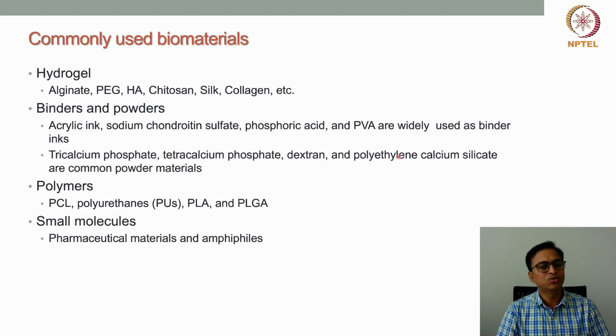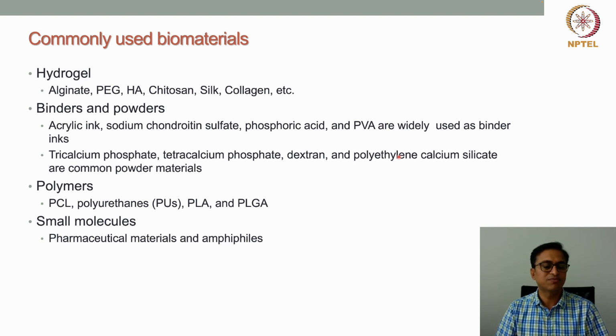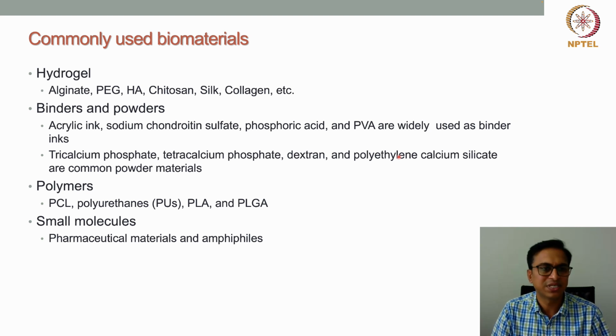But we need to consider the viscosity of these materials, because the viscosity should not be very high. Low viscosity materials can be very well used for making either 2D patterns or 3D structures, or patterning of these biomaterials, making different types of 2D patterning. Those things are very much done.